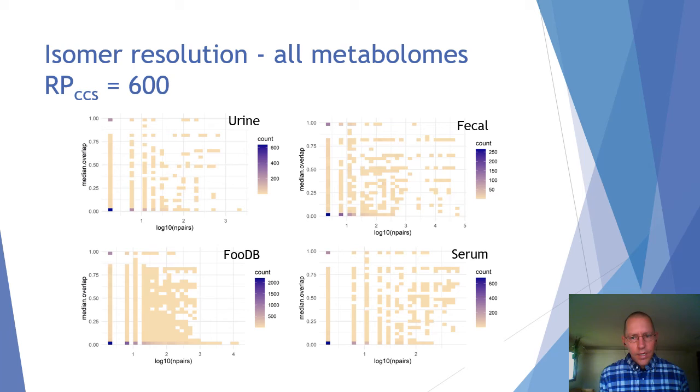So once we can more routinely achieve resolutions like this, and instrument development will continue, resolution will improve, we can anticipate that our probability of success of any given isomer pair resolving challenge is more likely to be good. That is, we can resolve any given isomer pair.